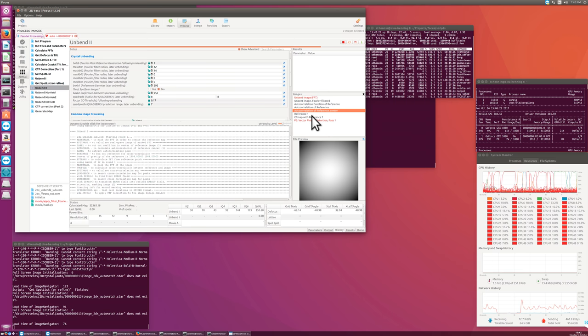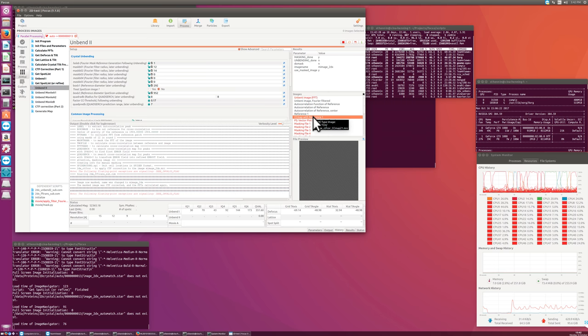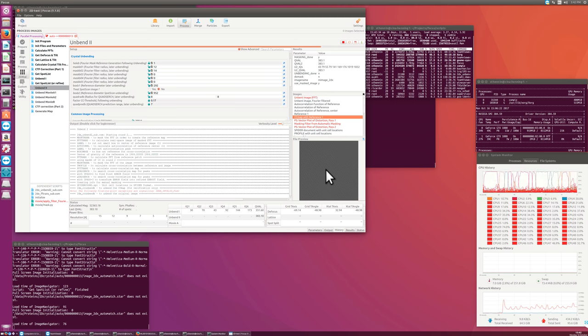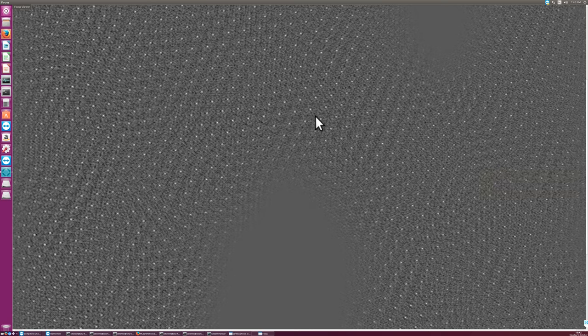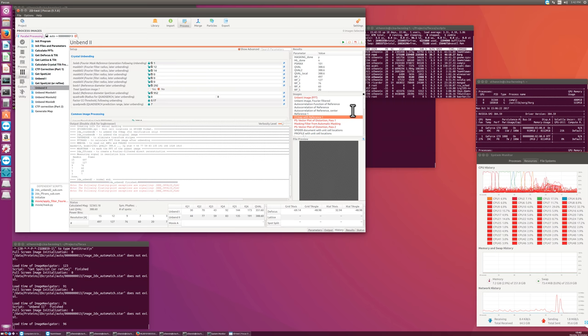In this cross-correlation map here, there was a zone with no crystal in the middle, and this area has now been masked away. If I double-click this here and make it smaller, we can see here zones where it's masked. And it's masked with a Gaussian edge so that we don't get any streaks in the Fourier transform. And only the areas remain that have a good crystal signature.